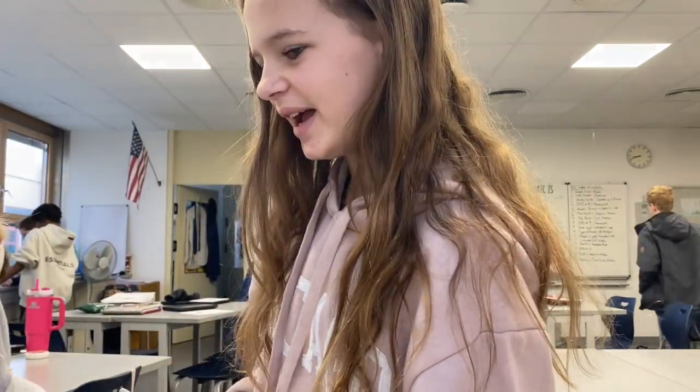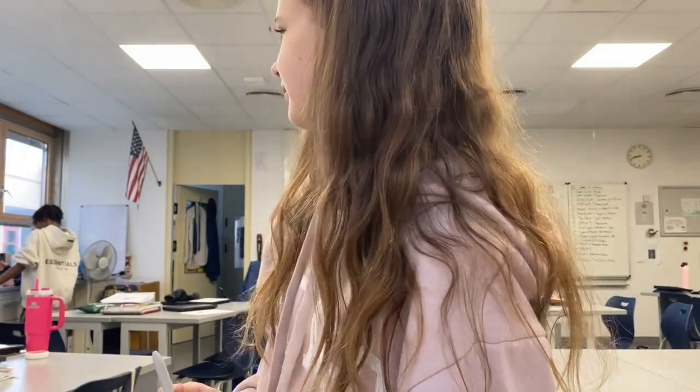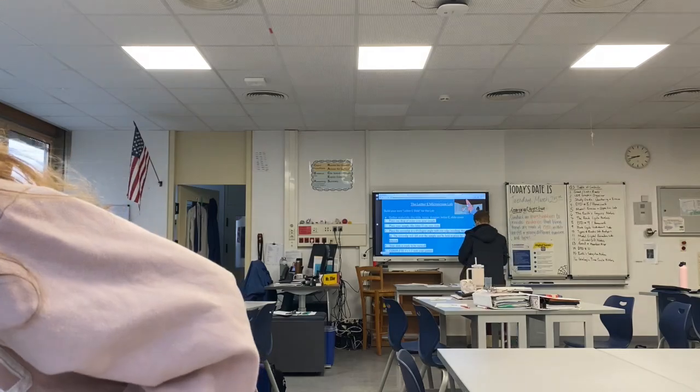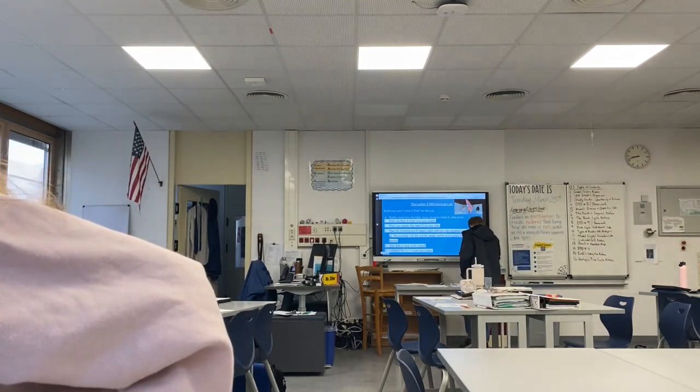Now it doesn't have to be centered. There's nothing on there, there isn't a slide. What you're going to do is you want your E to face you like this, so you can read it just sitting like this. So you put your E on top and then the cover slip.